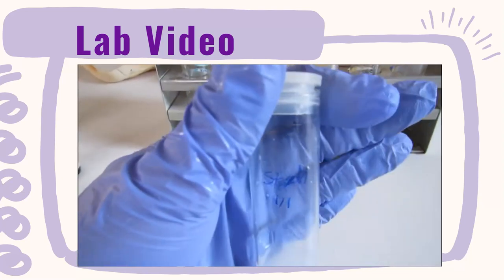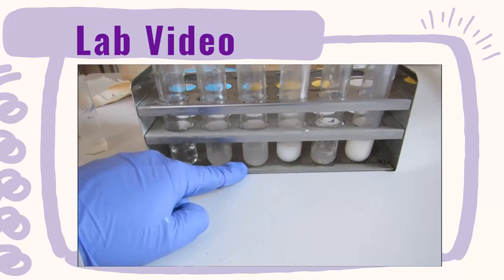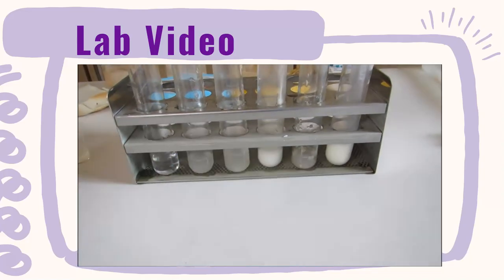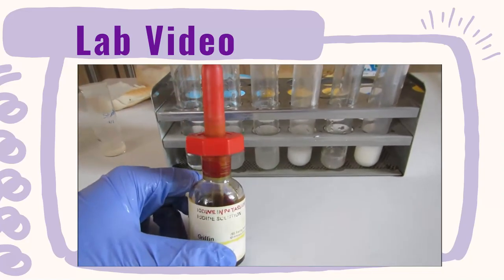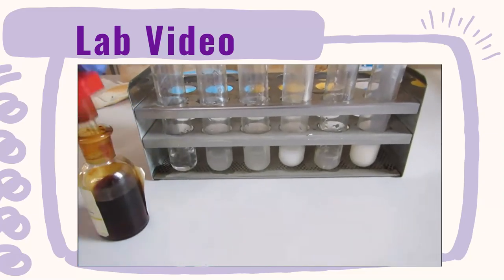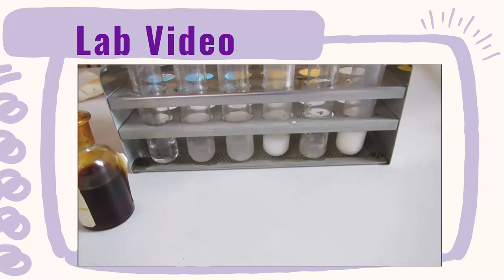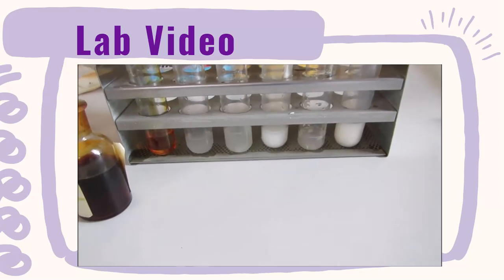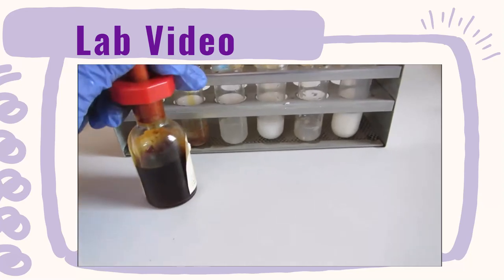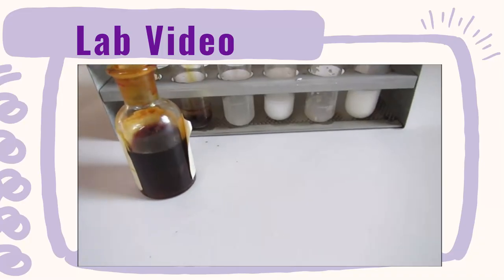So the next test is the starch test. As before, in the first one I've got my negative control, which is deionized water. The second tube is my positive control, which in this case is just a starch solution. Third is the bread, fourth is the cheese spread, fifth is the banana, and sixth is the milk. To test for starch, I then add some iodine solution to each of the tubes. So I'm just going to add the iodine solution and then I'll talk you through the result.